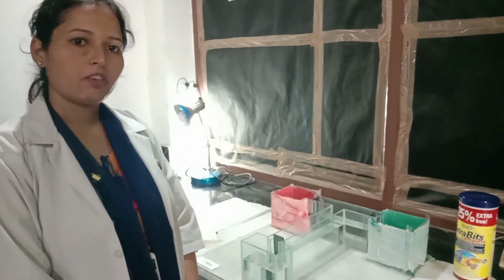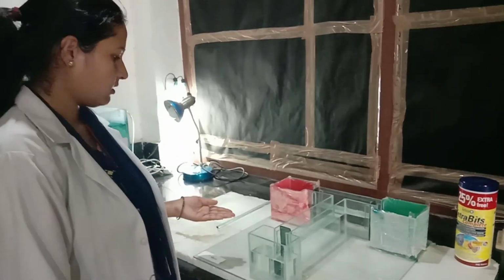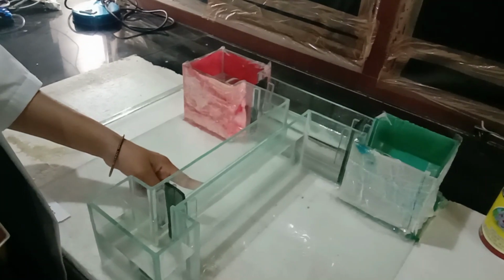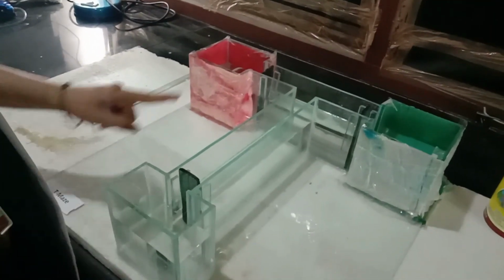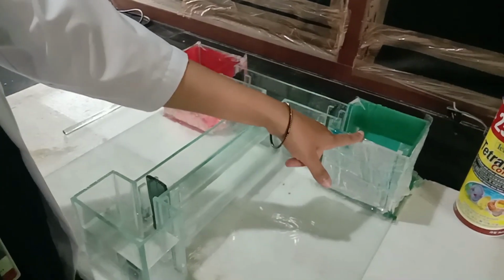So to assess memory dysfunction we have the T-maze apparatus. So this is the T-maze apparatus. This consists of 3 different arms. It's a T-shaped chamber filled with water. It consists of 3 arms, one long arm and 2 shorter arms. This is called the starting zone, and these 2 zones are called the unfavorable zone and the favorable zone.